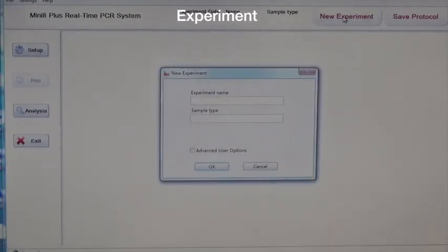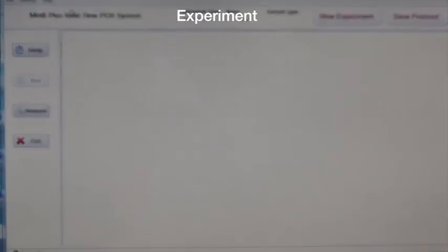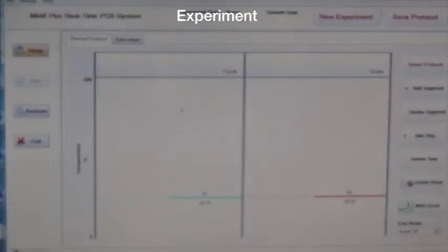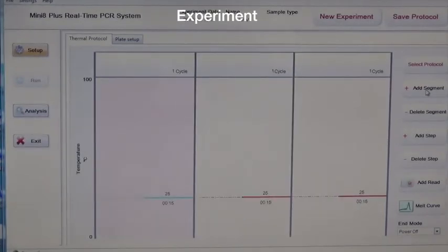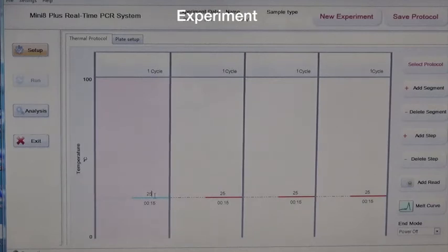Second, set up new experiments on SoftWell. Third, set up the thermal protocol according to the instructions.